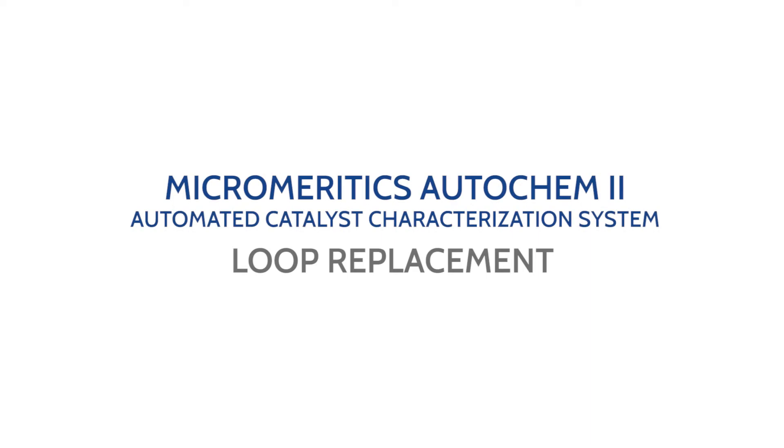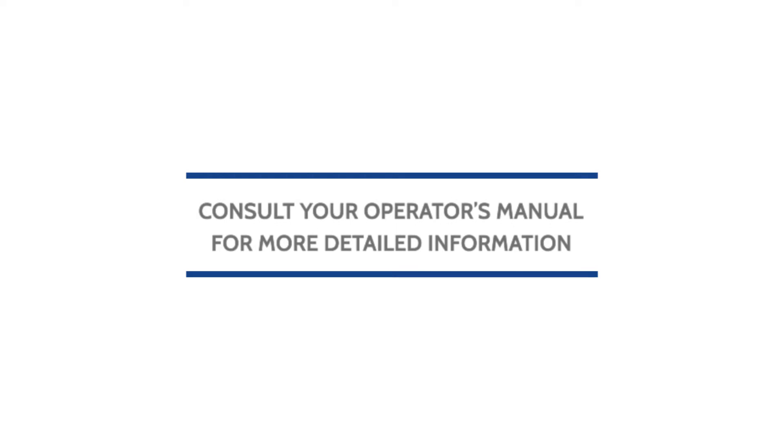This video will walk you through how to change the injection loop on the Micromeretics AutoChem 2 automated catalyst characterization system. Remember to always consult your operator's manual for more detailed information.